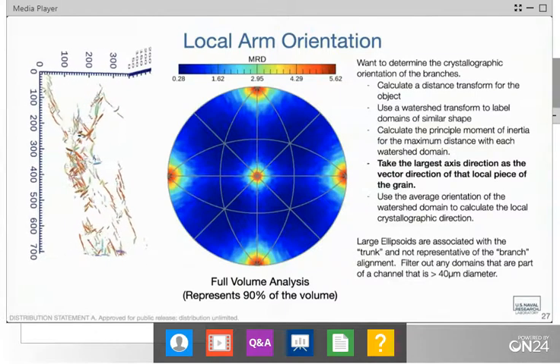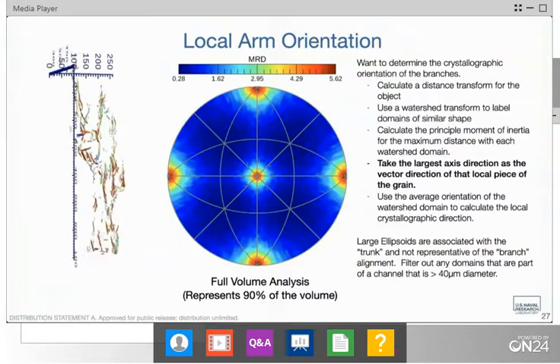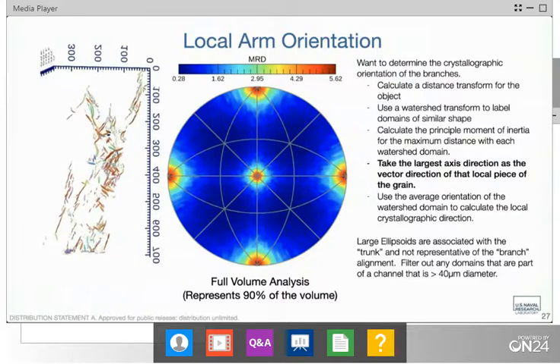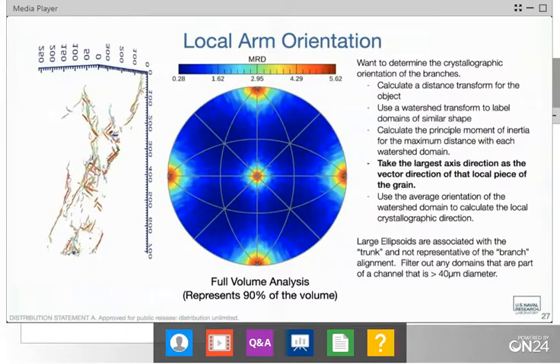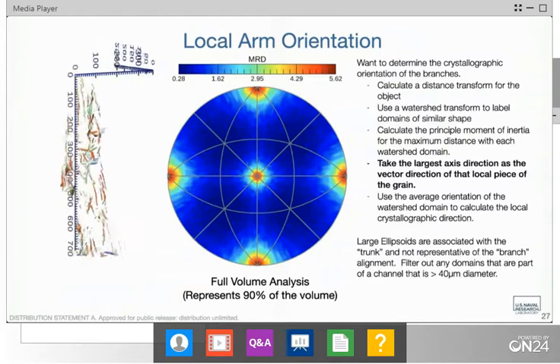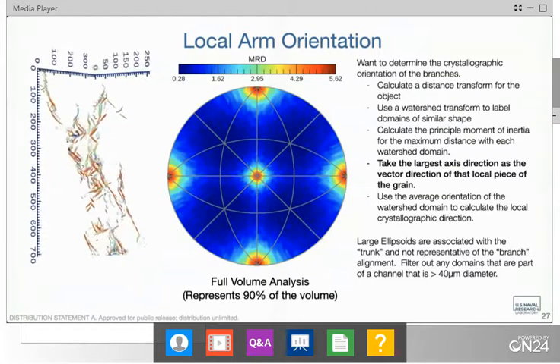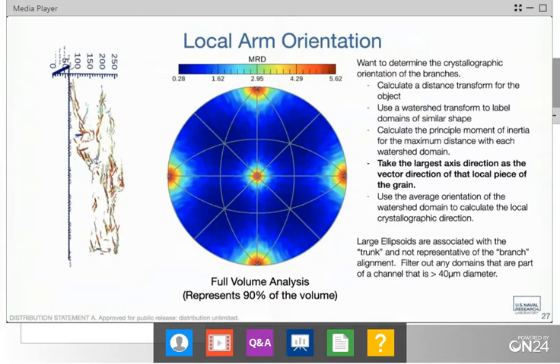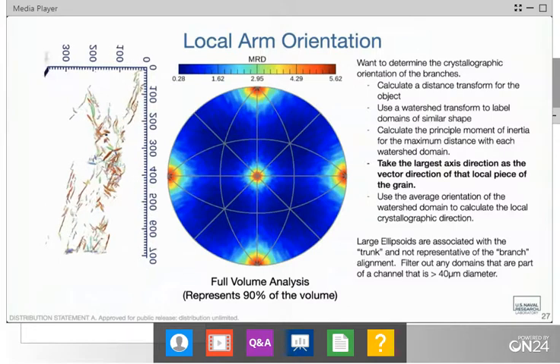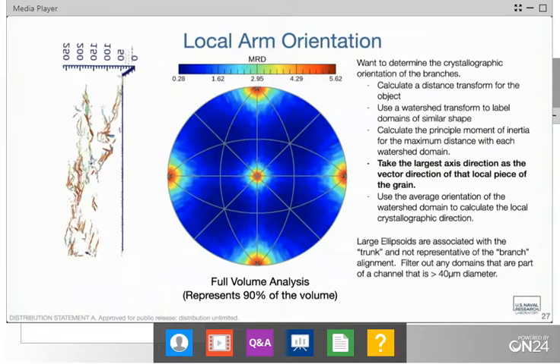Let's see here. How's the automatic control of the 3D EBSD system arranged? Is it through custom-made software, and if so, in what language? And they are also wondering how we interface with the EDAX Team software. So yeah, the vast majority of that is done with Python scripting with the TESCAN MIRA, as well as talking to our robot and sending some signals to the RoboMet. So that's mostly done through Python. And then we're negotiating through the Team API. And yes, we are continuing to work with EDAX on that and to make sure that it's robust.